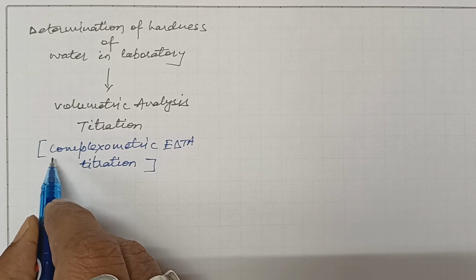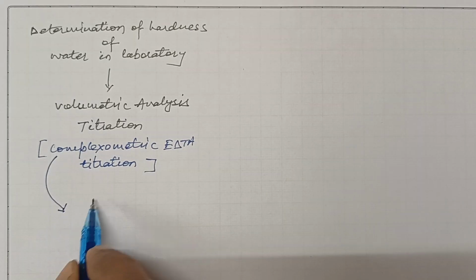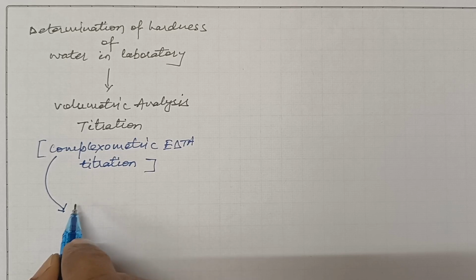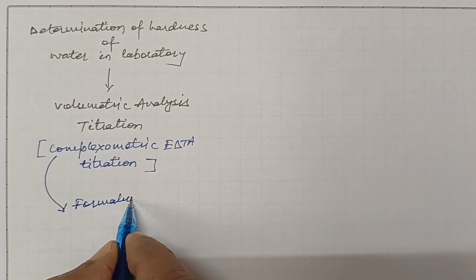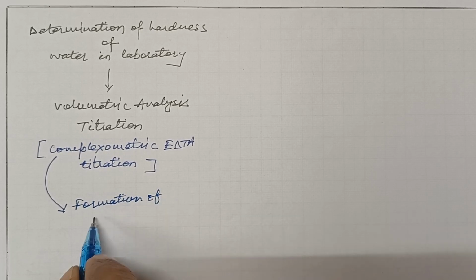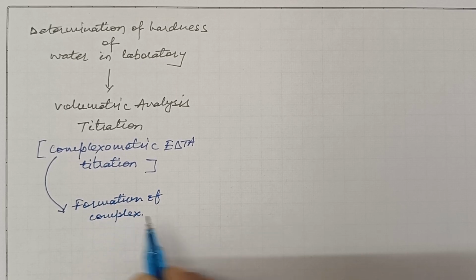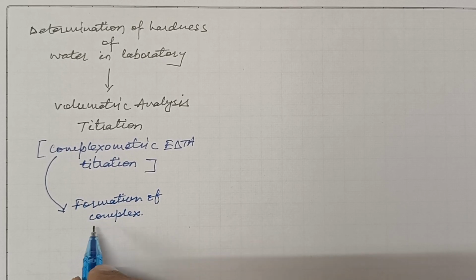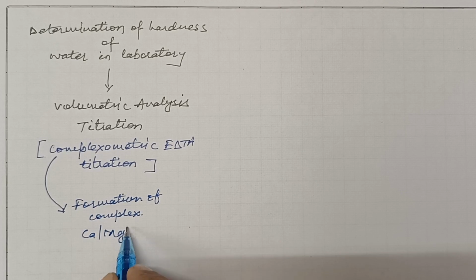because of the formation of a particular complex, and this complex is actually formed by calcium or magnesium ions.